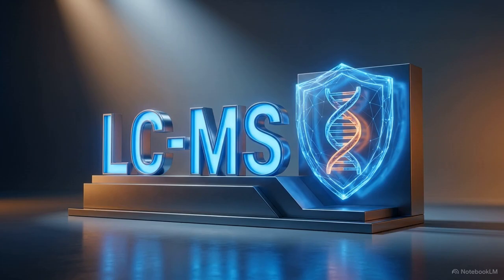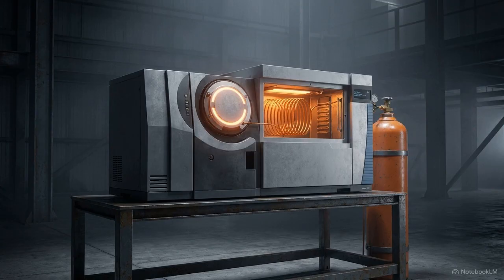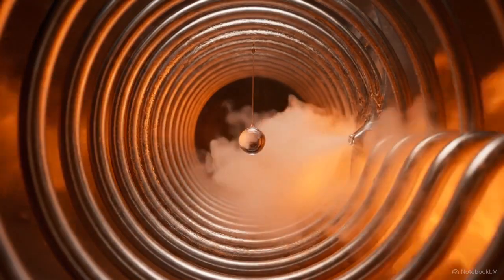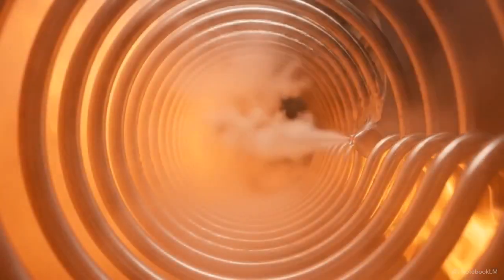Conversely, gas chromatography mass spectrometry, or GC-MS, is built for a completely different chemical profile. It's strictly reserved for highly volatile, extremely thermally stable compounds. Here, the sample is injected and immediately vaporized. It's then swept up by an inert carrier gas, usually helium, to begin its journey.